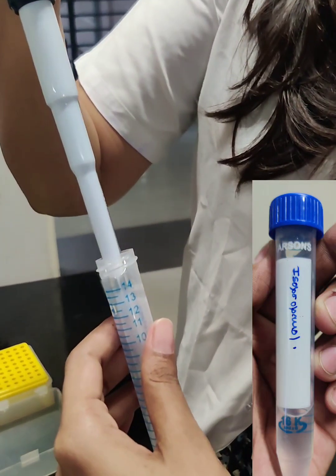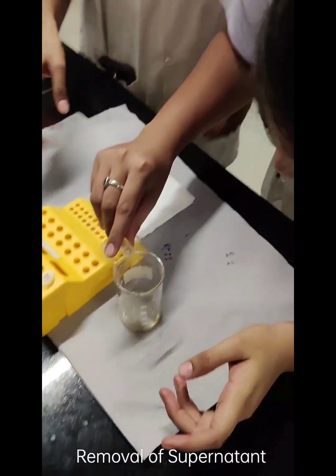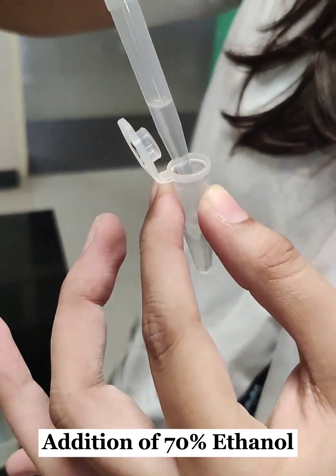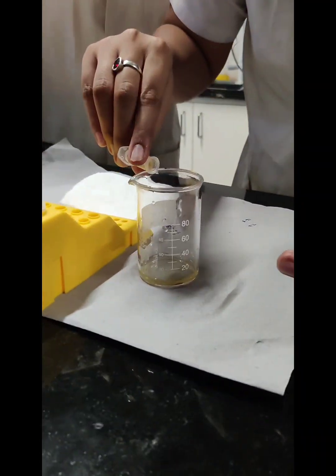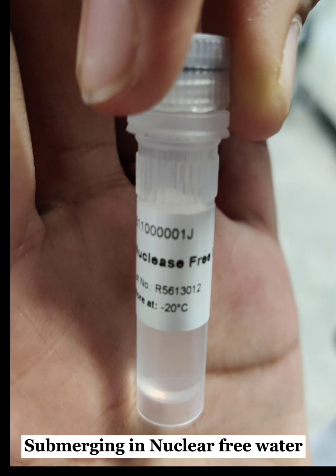We added double the amount of isopropanol, centrifuged again, and discarded the supernatant. Then 70% ethanol was added and the supernatant was discarded. We air dried the vials for four to five minutes.